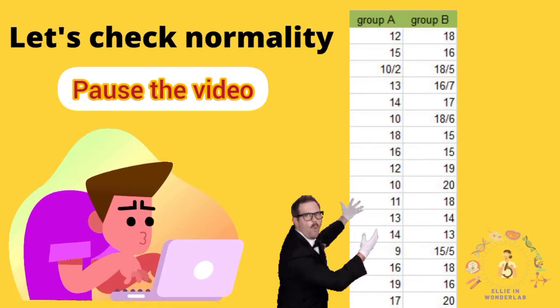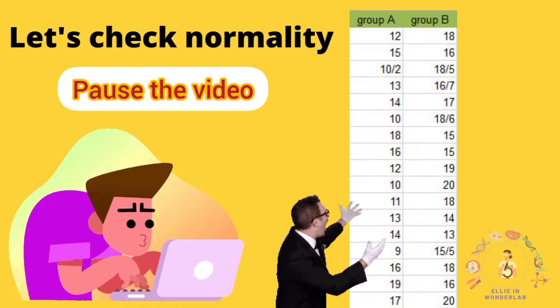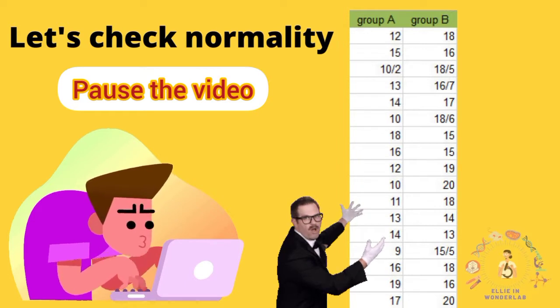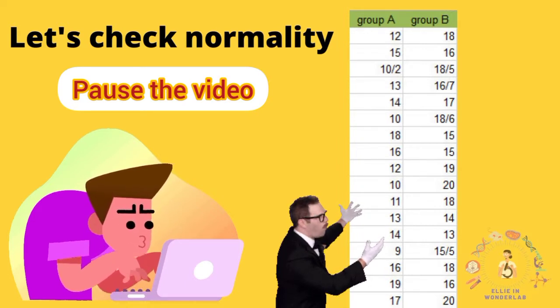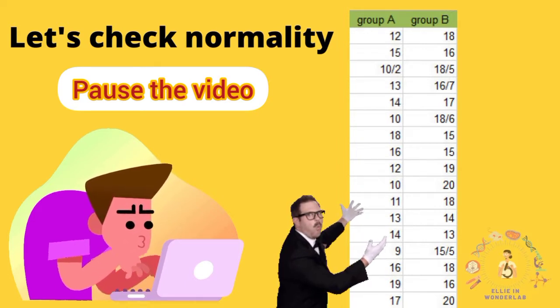Look at this data, pause the video here, open Prism and let's check normality step by step together.